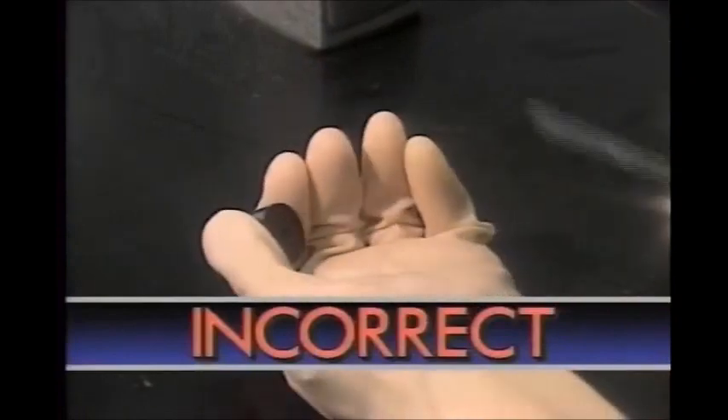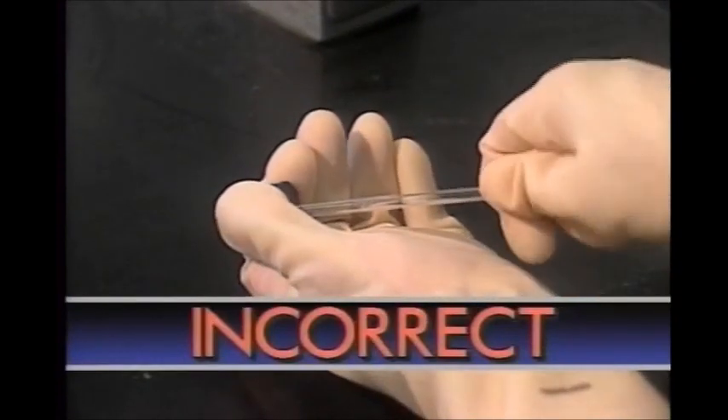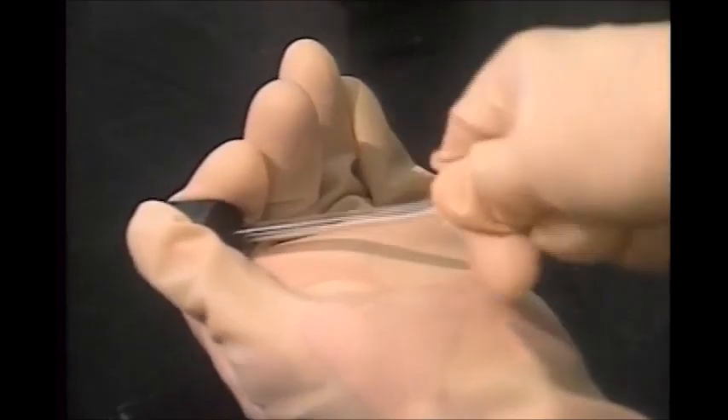The most common lab injuries are cuts from broken glass, especially glass tubing. A typical accident comes from using too much force to push a tube through the hole in the stopper.